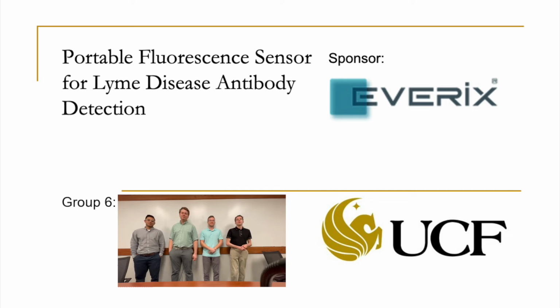We're group 6 and we're creating a portable fluorescent sensor for Lyme disease antibody detection.